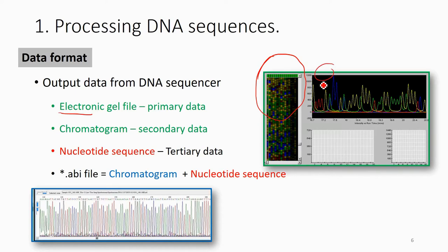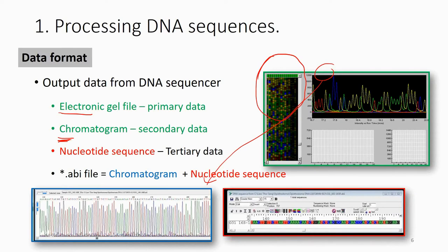The software turns this image into a chromatogram. Based on the chromatogram, it can read the nucleotide and give you the nucleotide sequence file. If you double click this file with proper software, it will show you the sequence with peaks. Some peaks may be too close to each other — the software might interpret two T's as one T, for example. So you need to check it and make corrections in the nucleotide file. This is an ABI file — the raw data output from the sequencer.